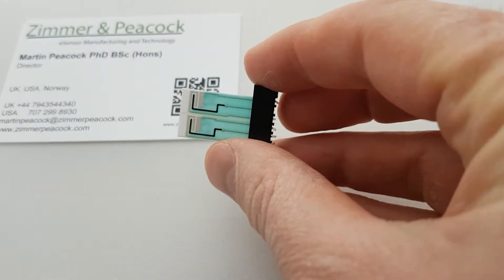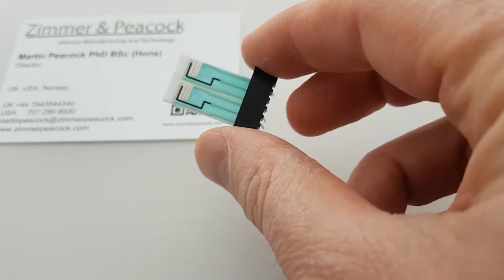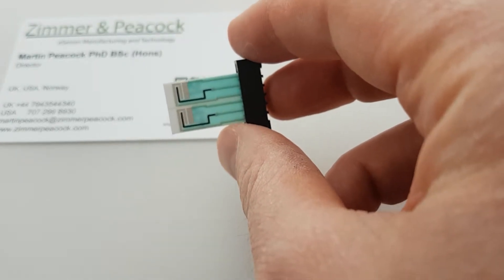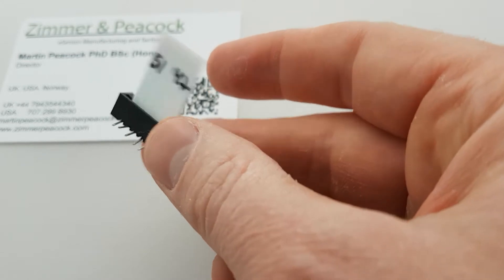What we're showing here is that it's fairly straightforward to have a two or more working electrodes array system. This is actually one of our standard products. There's two of them together, and what I've not done is I've not snapped them apart. As you can see, it's one whole piece.